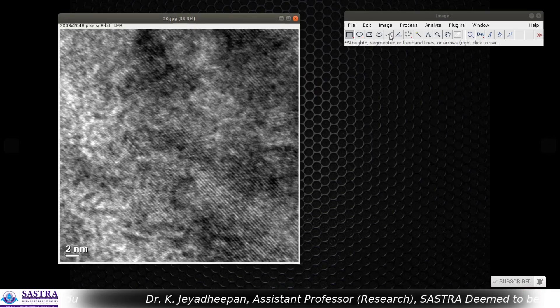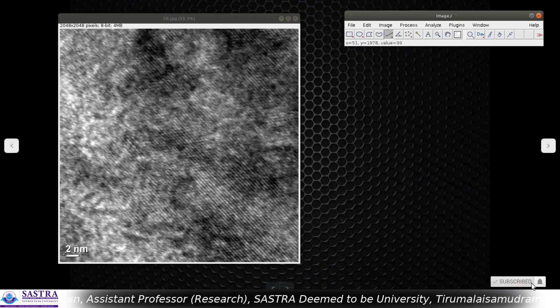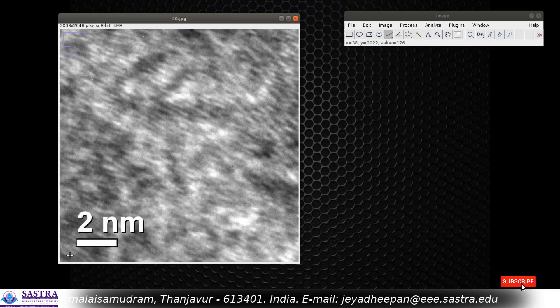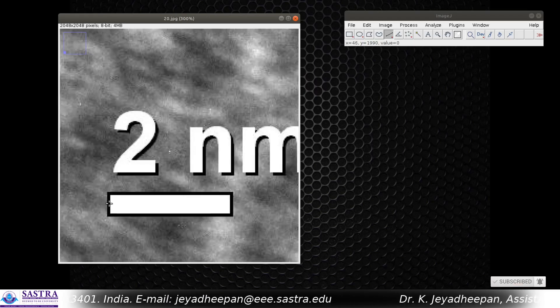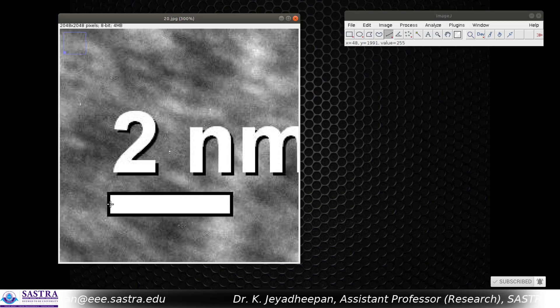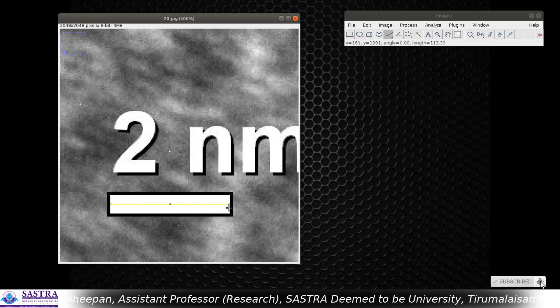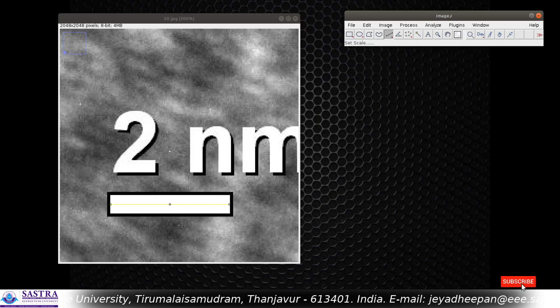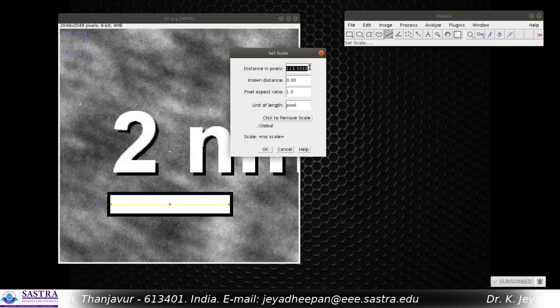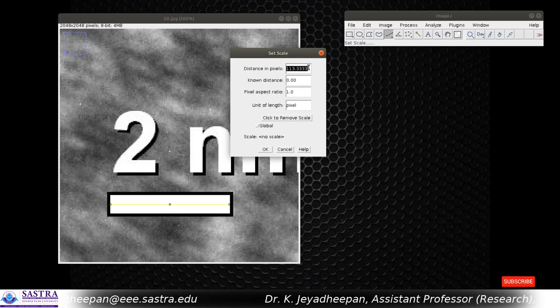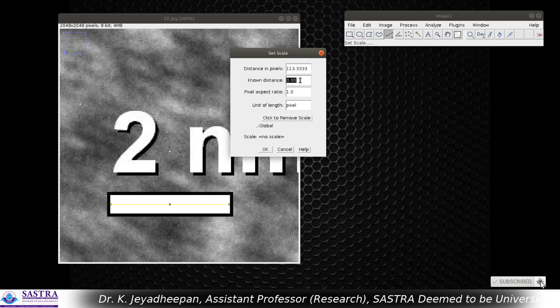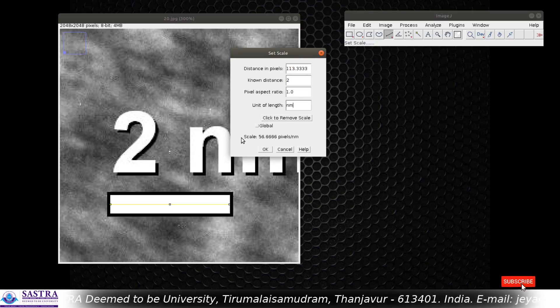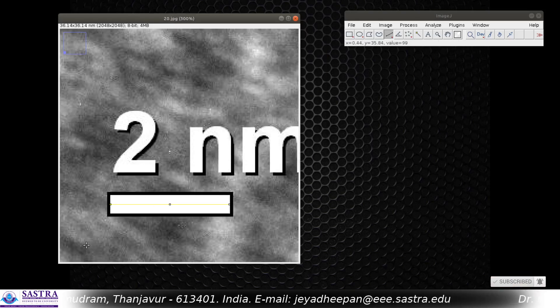The first thing we have to do is calibrate the image. For that I am going to take the straight line tool and magnify the image using the plus and minus keys. By holding the shift key I am going to draw one straight line over the scale bar. Then go to Analyze and press Set Scale. Here roughly 113.33 pixels are 2 nanometers — that is the known scale given in the scale bar. So I have now calibrated the image.